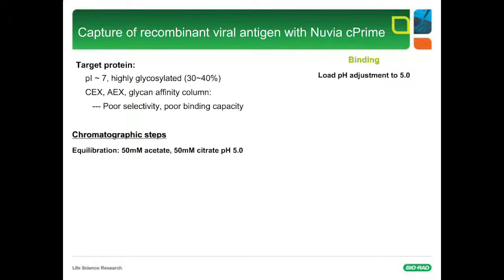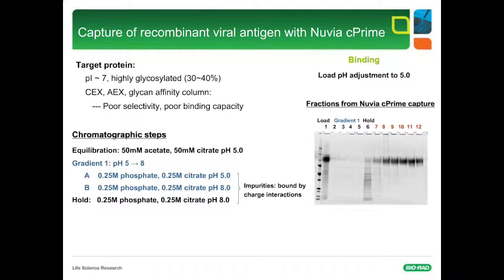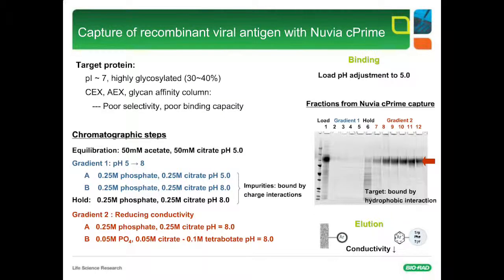When we first suggested they should do the elution at pH 8, that was the only chemical available in their lab for controlling the buffer pH. Since then, they have already switched. They are no longer using the tetraborate. In other words, you don't have to use these chemicals if you don't like it. Okay, it's just for pH control purposes. Just for pH control. That's a good answer.